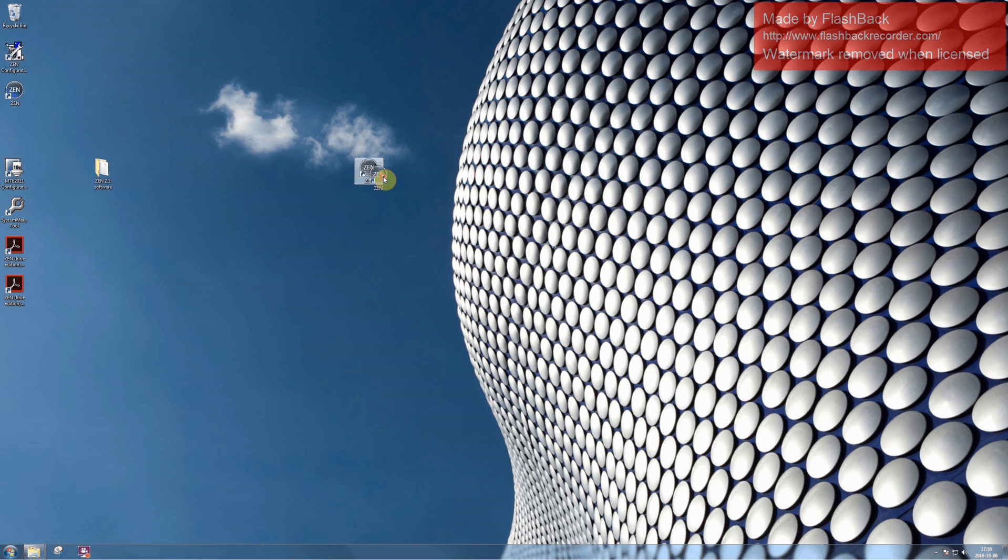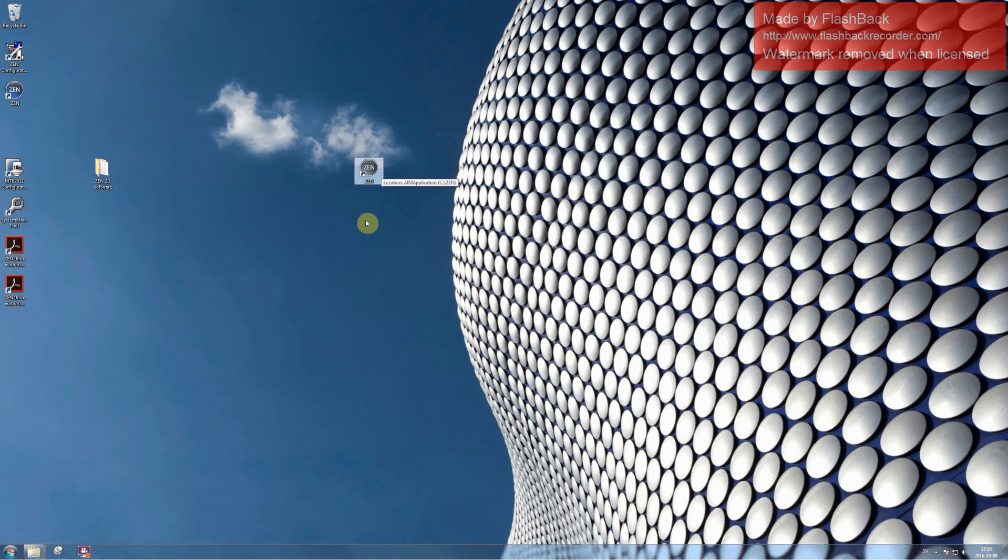Now you will have access to an offline demo simulator of our Confocal Microscope.